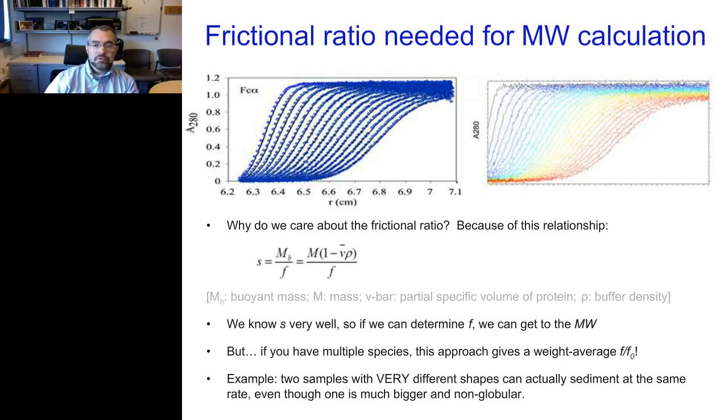Let me give you some examples from my own lab. On the left is the Fc fragment of IgA1, and you can see, if I click on here, I hope that shows up, that it has a slope as illustrated in the gray dashed line, and I've highlighted with red. On the right-hand side, we have another protein. This is one of our biofilm proteins that is basically this elongated thread-like protein. It is very, very, very elongated, and so this is clearly a very non-globular situation.